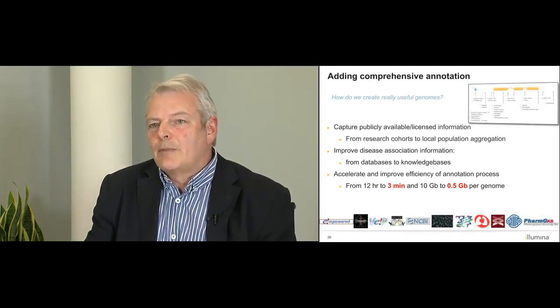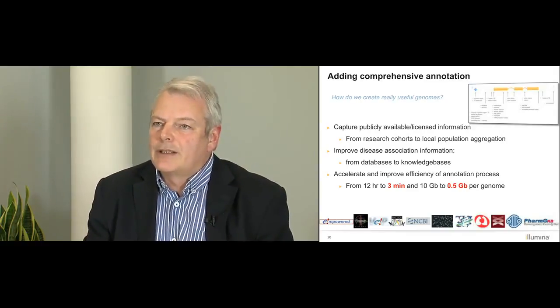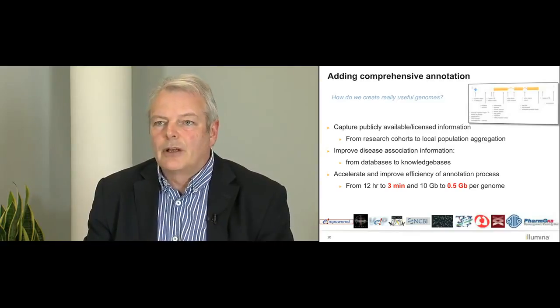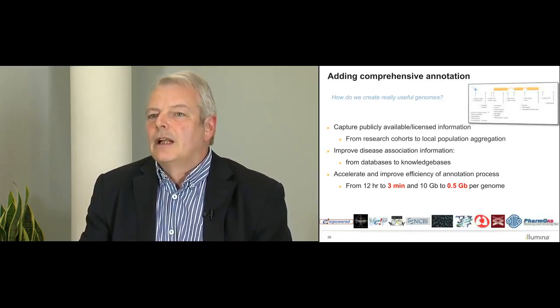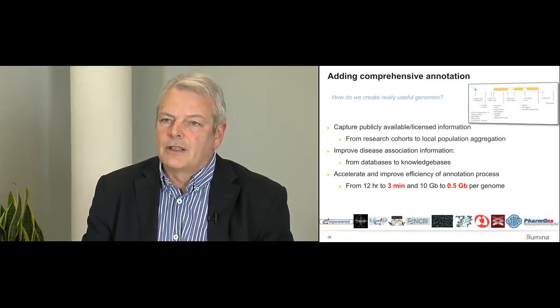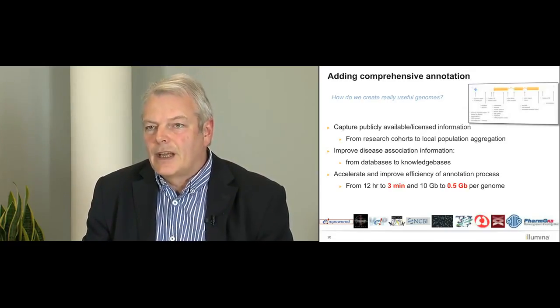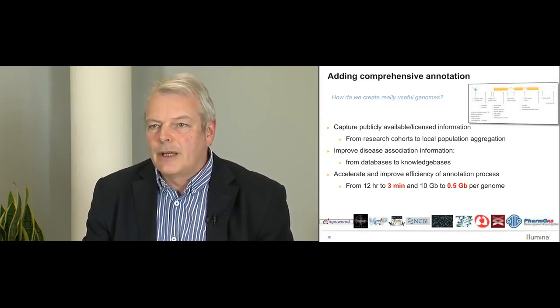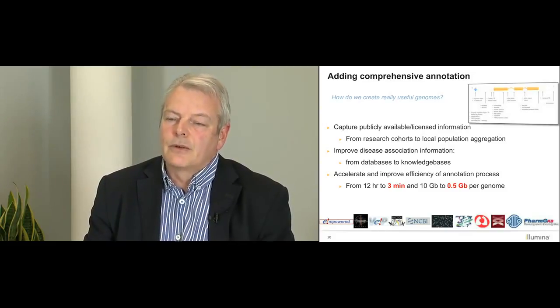I mentioned annotation in passing. Once again, there's much to be said about capturing publicly available and licensed information from research cohorts and from local aggregation. This helps to improve disease association information, and in particular the feature here is that we've done a great deal to work with VEP and related annotation engines, but actually reduced the time again from 12 hours a genome to 3 minutes, and from 10 gig to 0.5 gigabytes of space storage required per genome.